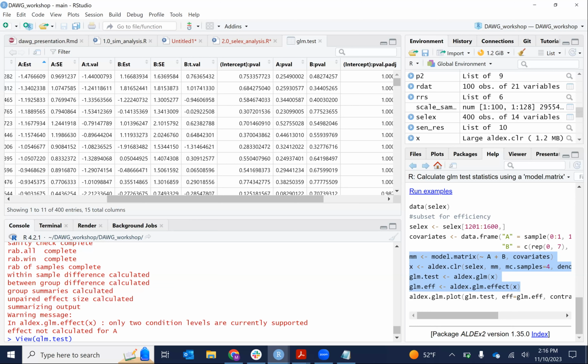The main story is, if you take away nothing else from this talk, normalizations imply something when you're doing these methods. Every method has to make some assumption. Whether or not it holds for your data set is something to think about, that's the argument. And furthermore, I'm a statistician, and I can't interpret some of the supplemental information that's put out there. It's hard to understand what's going on in these methods, and so transparency is key.